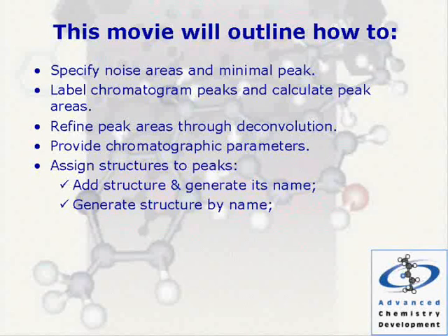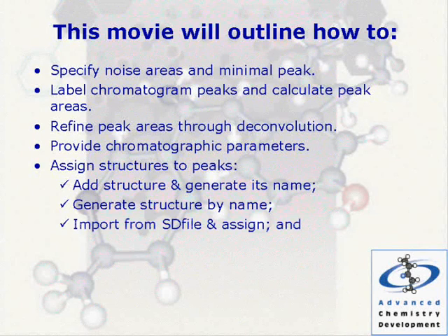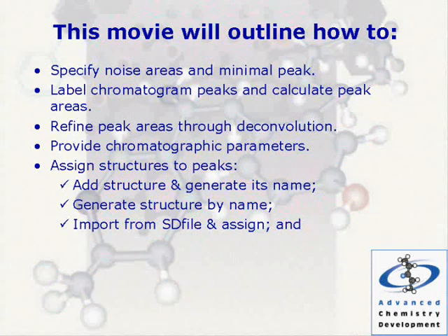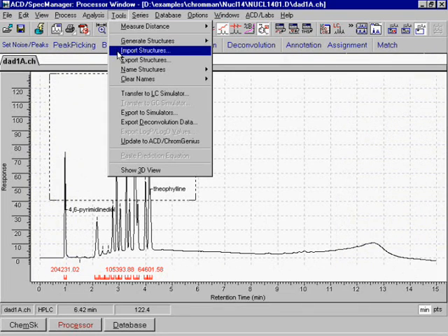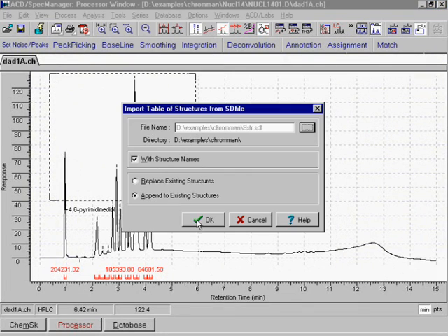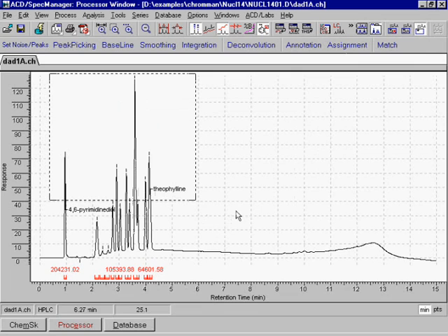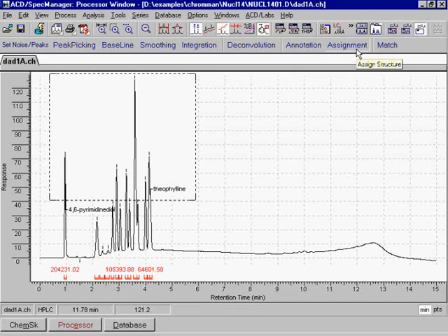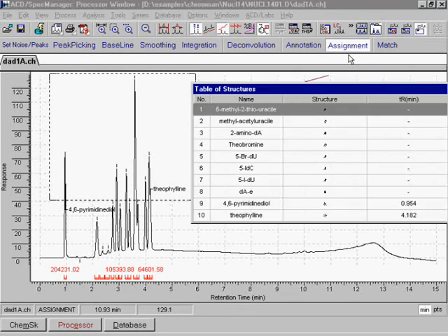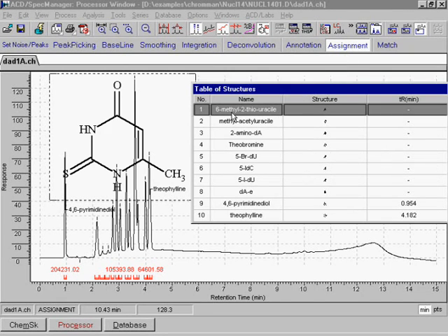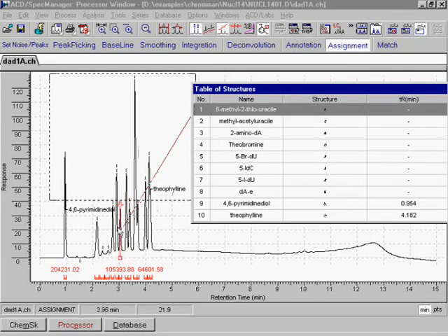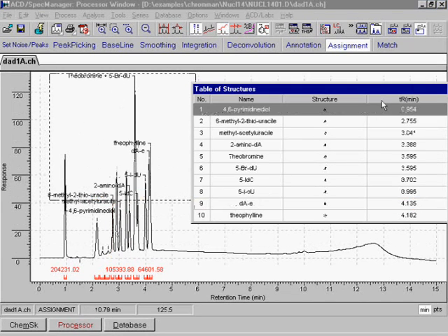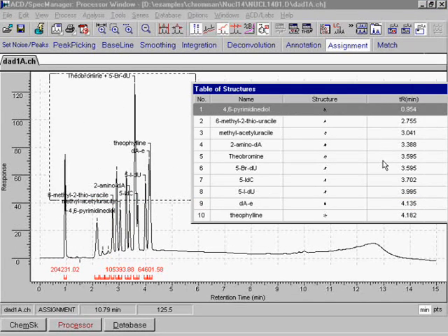Import from SD file and assign. A set of structures can be imported from an SD file. Each of them can then be attached to the corresponding peak using the assignment tool. The retention times of the peaks are automatically added to the table of structures.